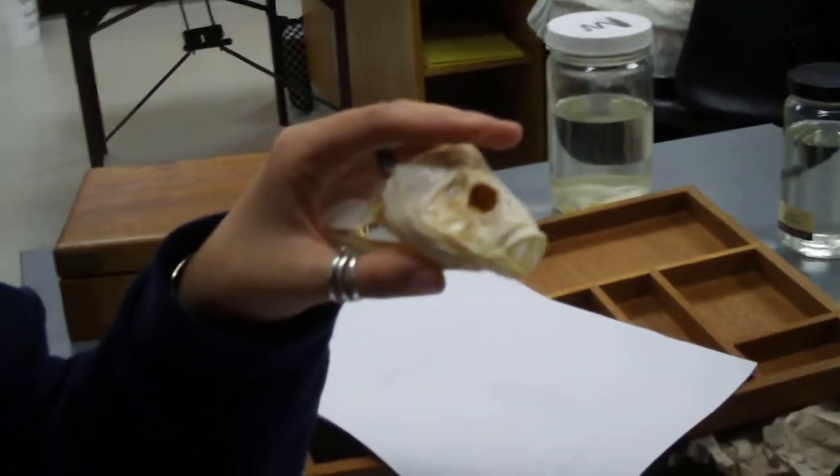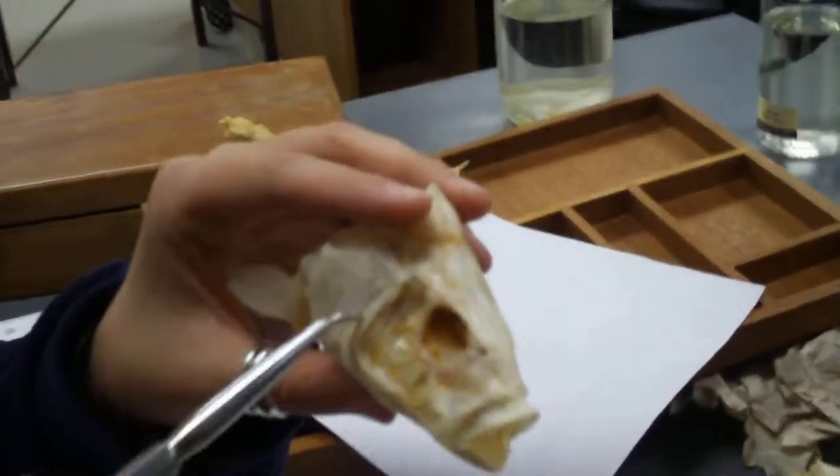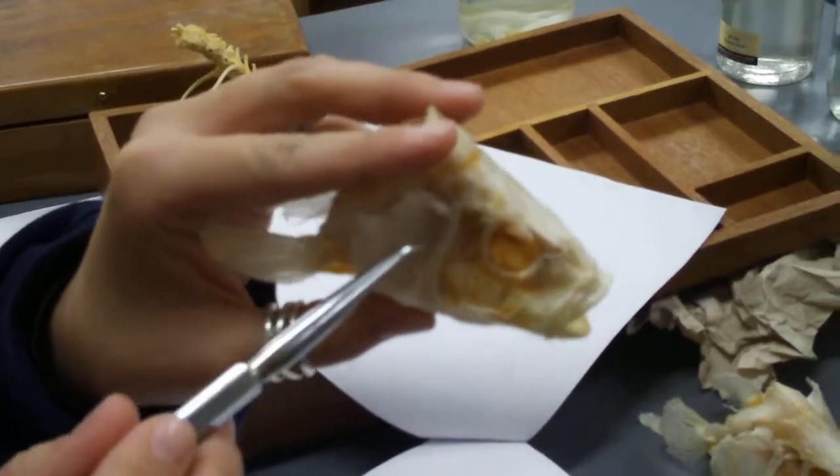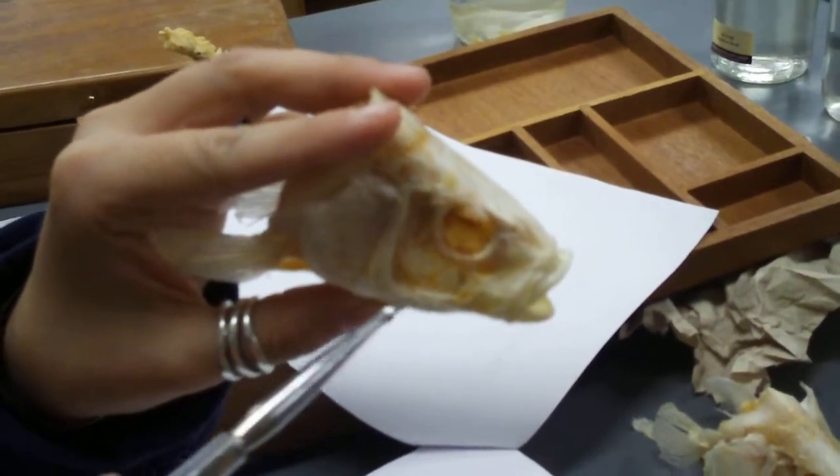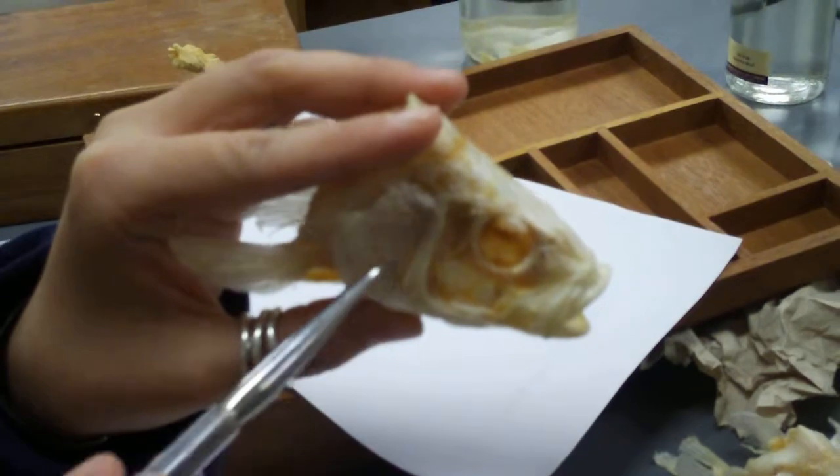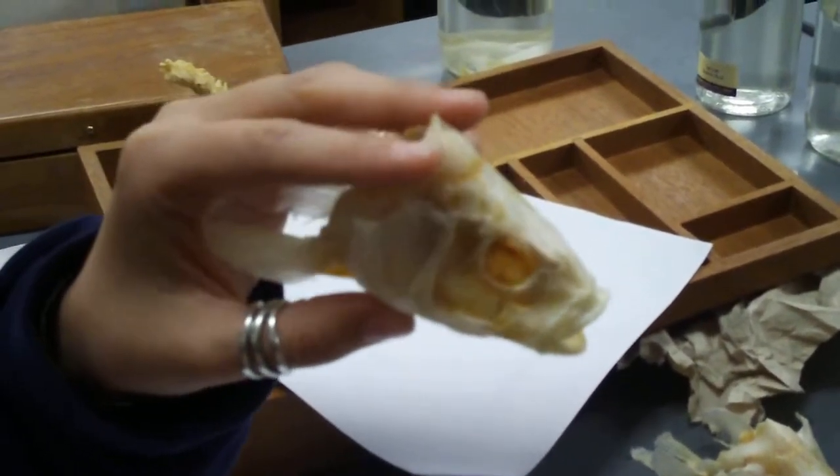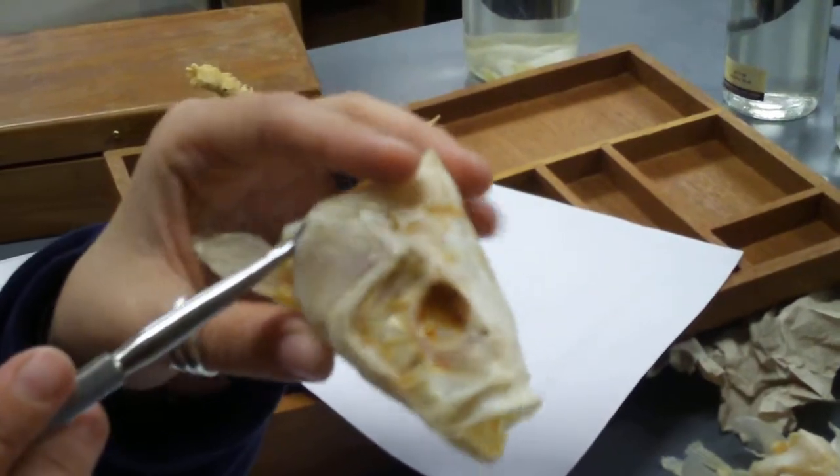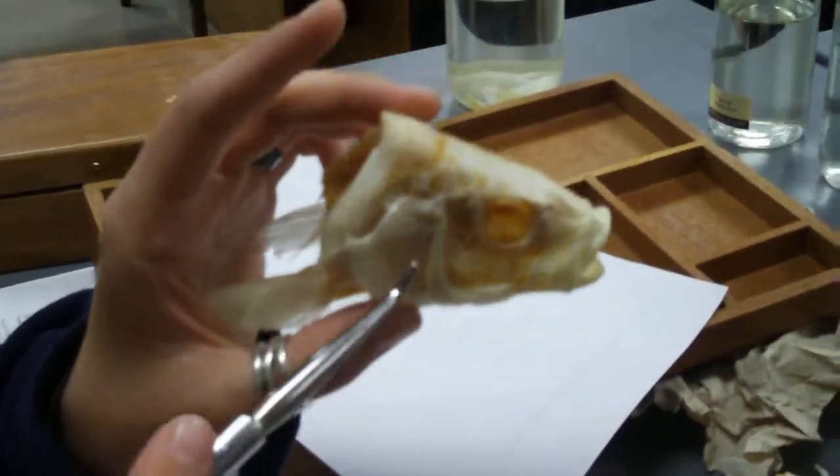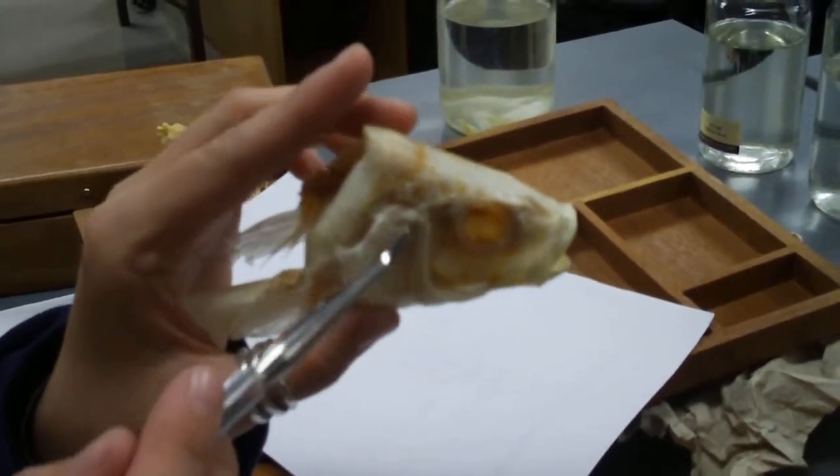Okay. Then you have your pre-operculum which is kind of this rough, kind of thin L-shaped thing. That's the pre-operculum. And then you have the operculum which is this large part right here. Can you guys all see that?